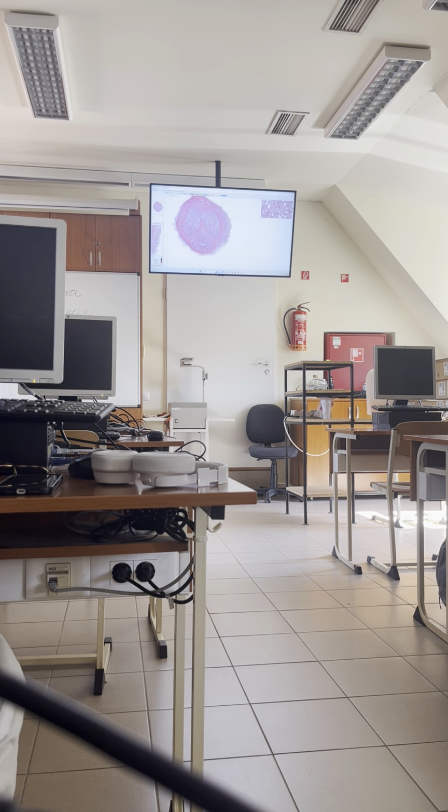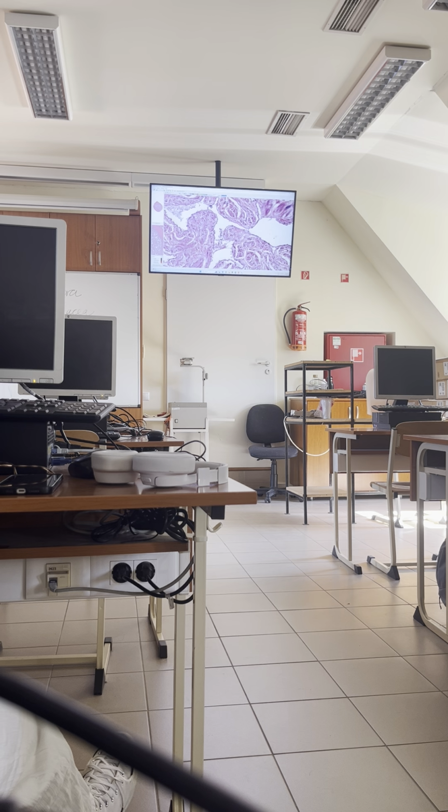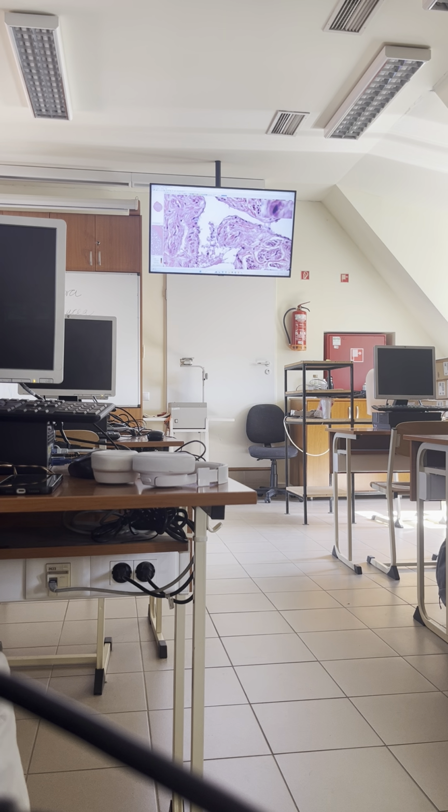Ebner's cushions. Here in the corpus cavernosum, you can see structures like something like this, a kind of evagination towards the lumen of the caverna. And this fibromuscular tissue contains smooth muscle cells as well.